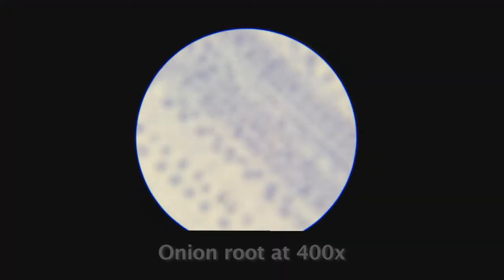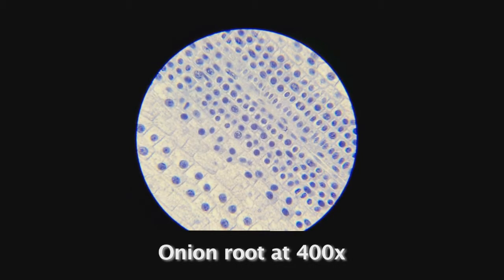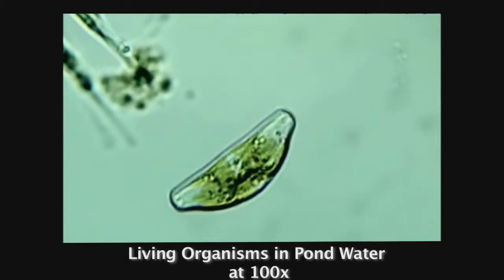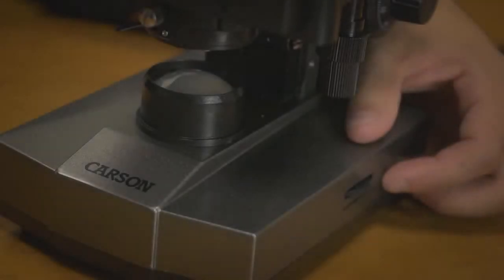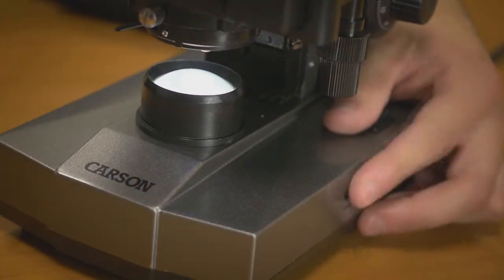First use the coarse knob to find your image. Once in focus, use the fine adjustment knob to further sharpen your results. This particular microscope gives you a lot of options when dealing with light control. Not only is the light source a bright white LED, but you can even adjust the intensity.